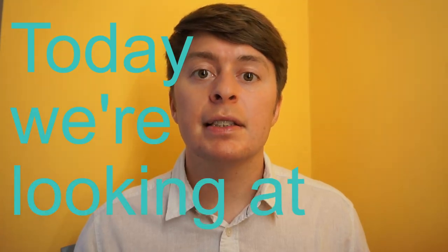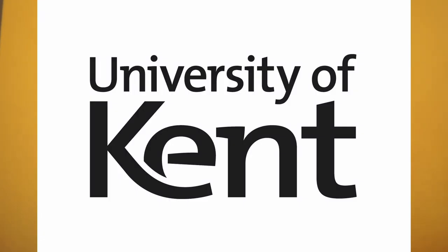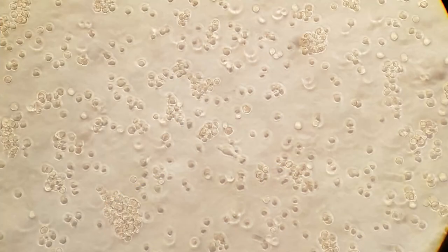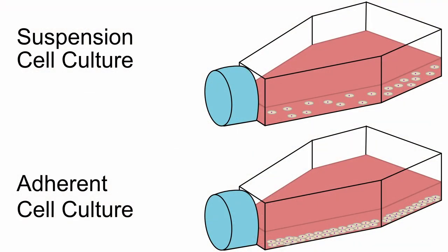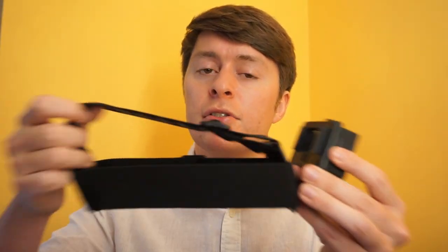Today we're looking at cell culture. So when I was working at the University of Kent, I worked on Jurkat cell cultures, which are suspension cell cultures. This means that cells aren't adhered to the bottom of flasks. They are in suspension. And the way I filmed it was using one of these, a GoPro strapped to a head strap. And the reason I use this is because I need my hands to do the cell culture.